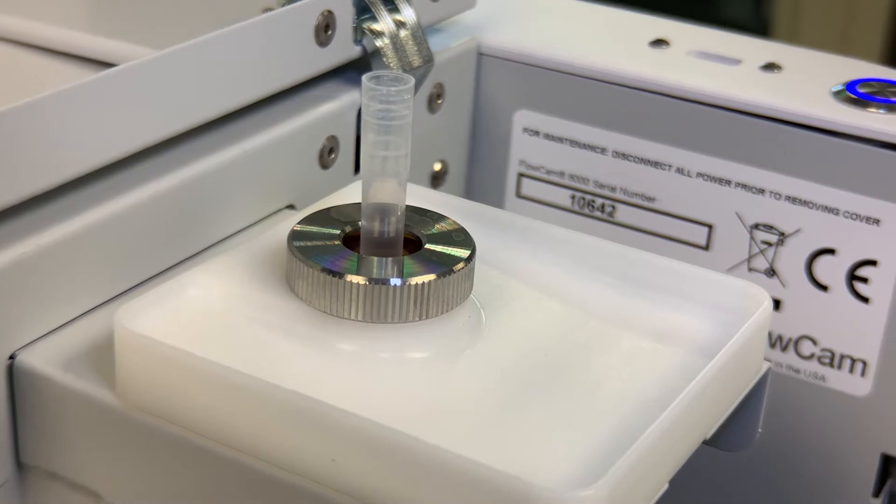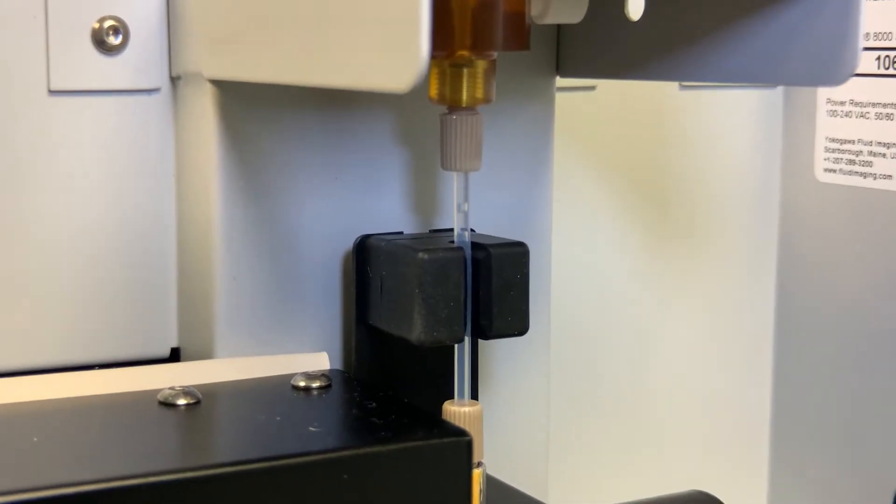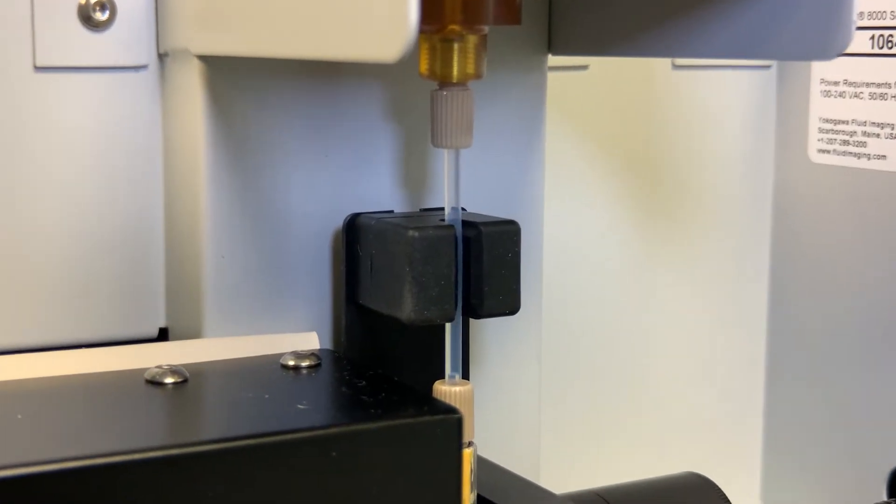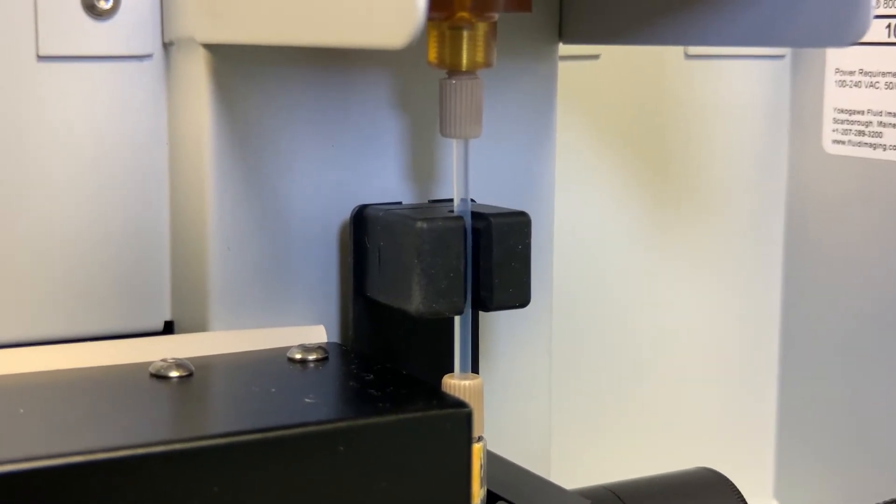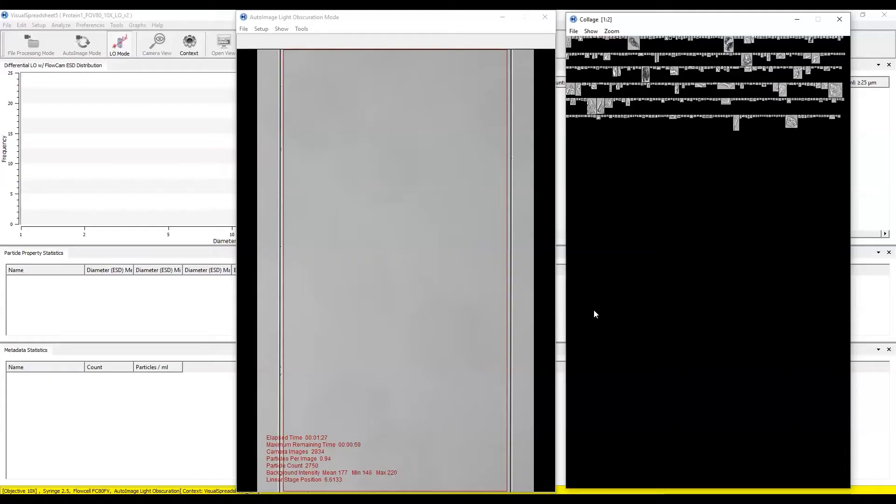The sample is then drawn into the flow cell, where the objective and high-resolution camera magnify and capture the sample's particles.